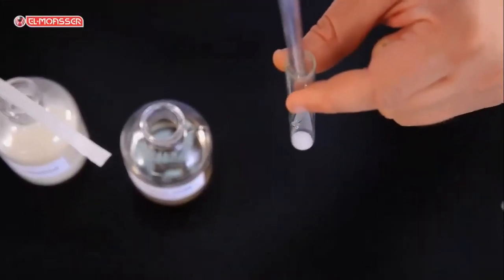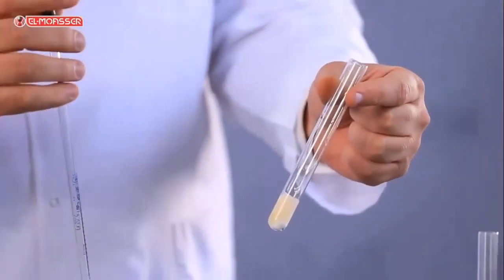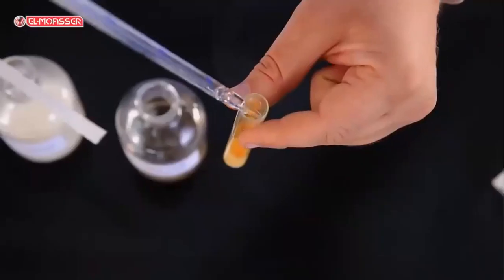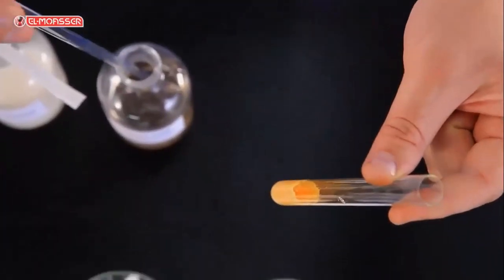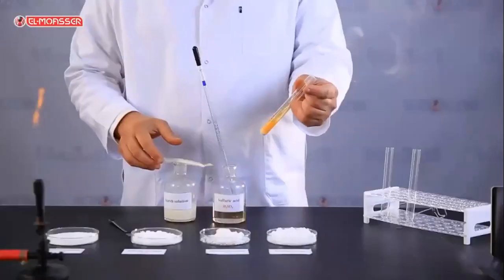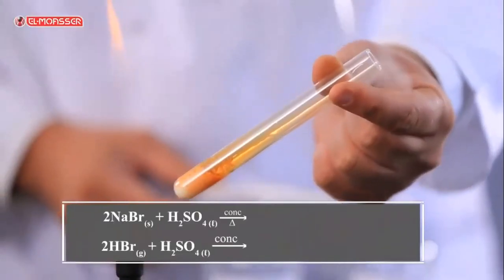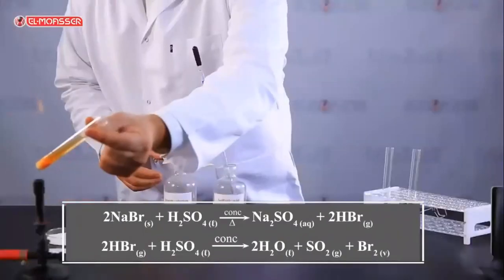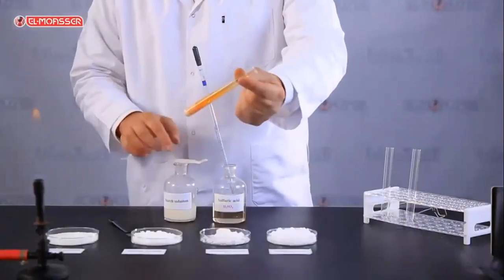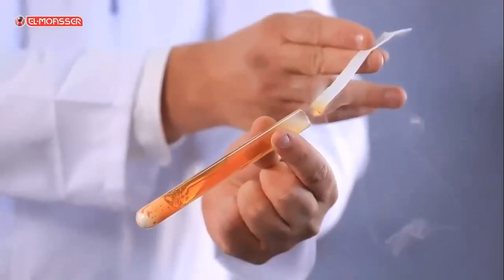What do you observe? Effervescence takes place due to the evolution of hydrogen bromide gas, which is colorless and partially oxidized by the sulfuric acid. Orange-red fumes of bromine will be separated and increase by heating, and turn a paper wetted with starch yellow.